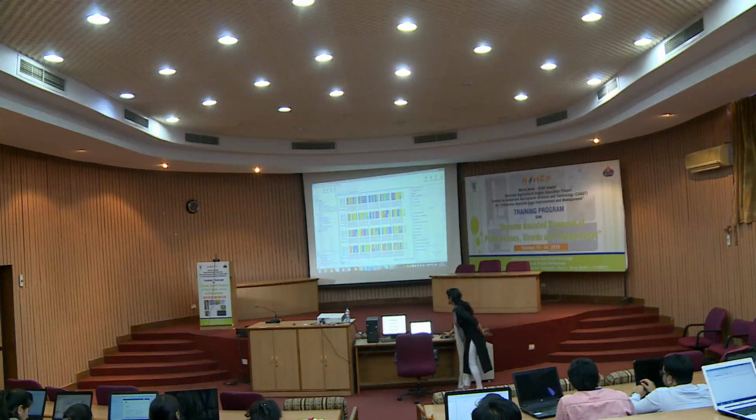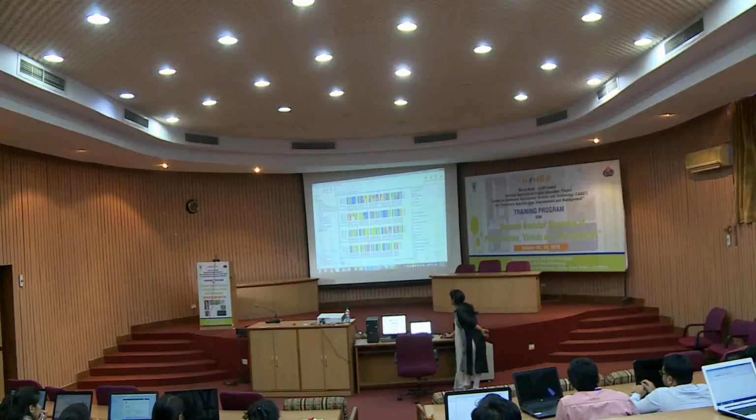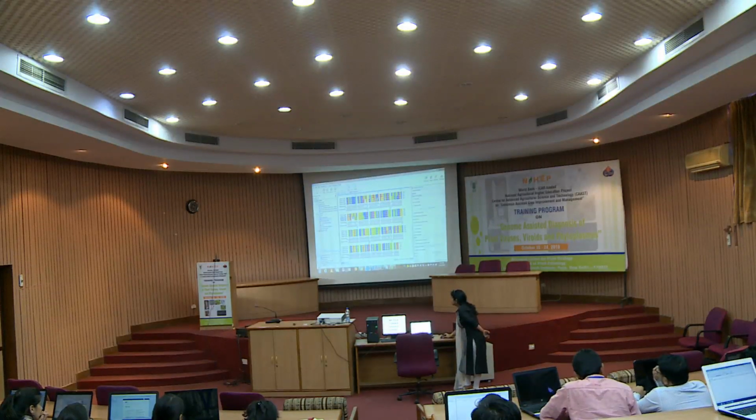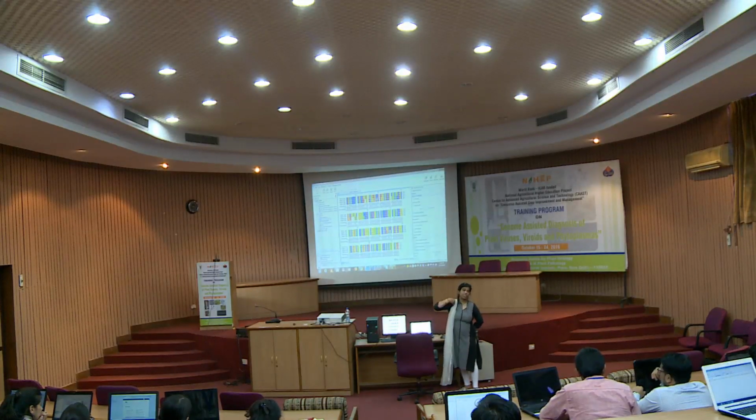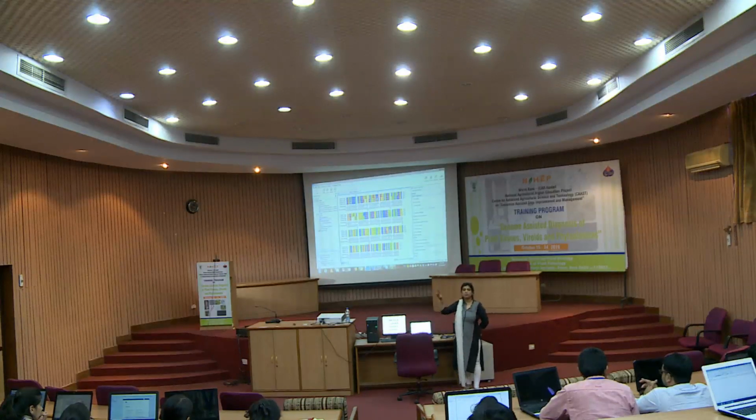Okay. So, now here if you can see, everything is starting from the same base and ending at the same base, right. And you can see there are certain deletions in these 2 samples K and A, but in 1 and 2 there are some bases present, G, T, A. It means this G, T, A is actually an insertion of bases in these particular samples. So, these are sequence variations only, these are not errors, correct.